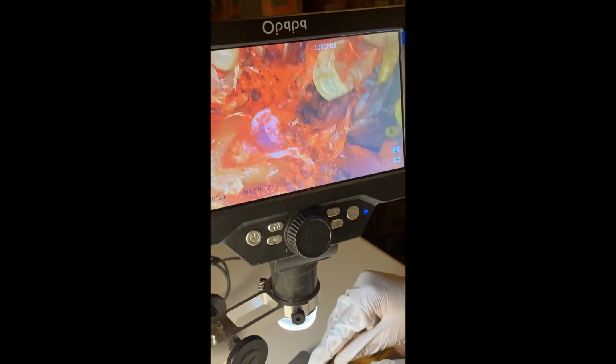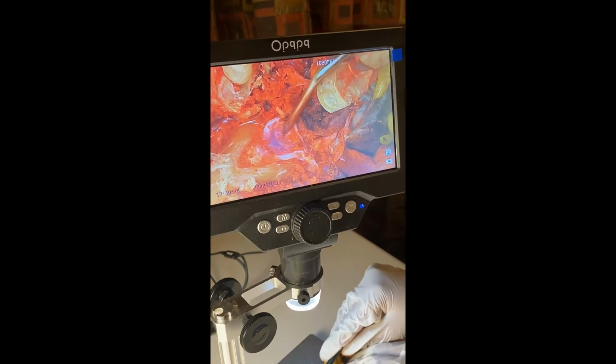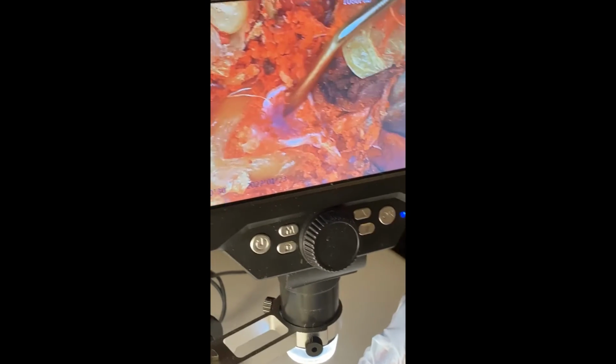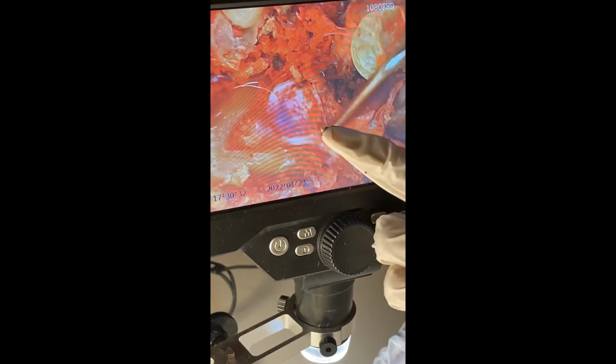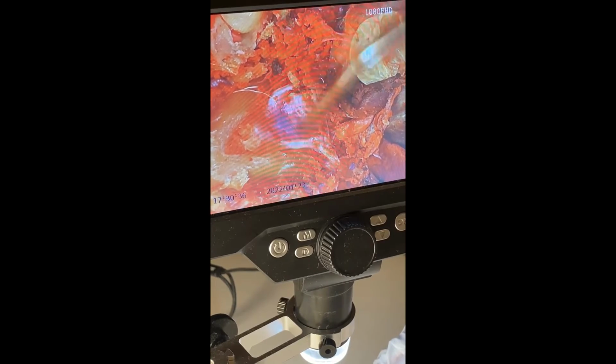Okay, so you can see that there's a lot of dye covering it, but right underneath all that is the heart, this pink pouchy structure. Right over here where my probe is, that's going to be the heart of the frog.